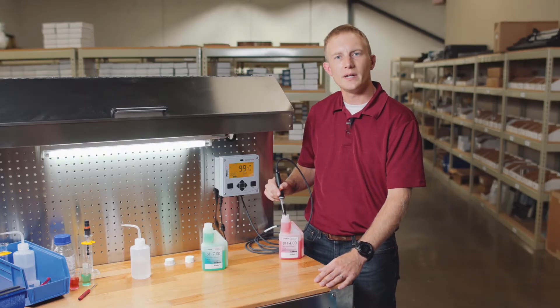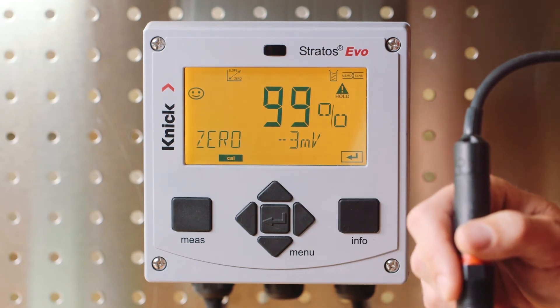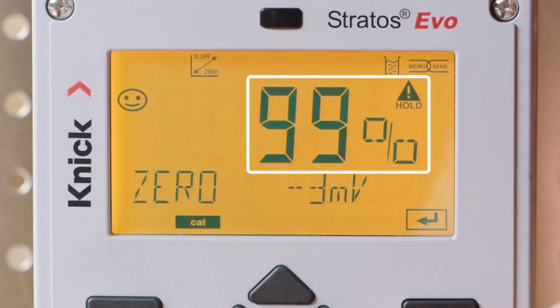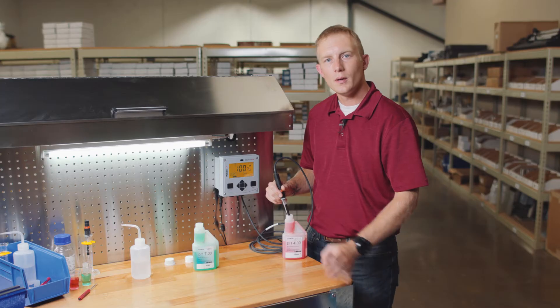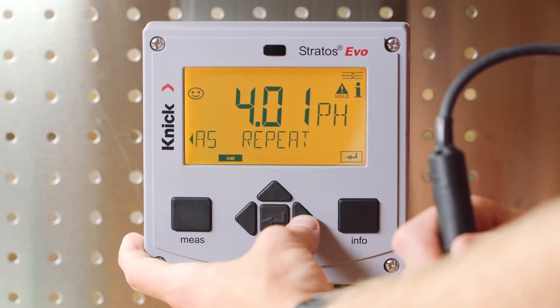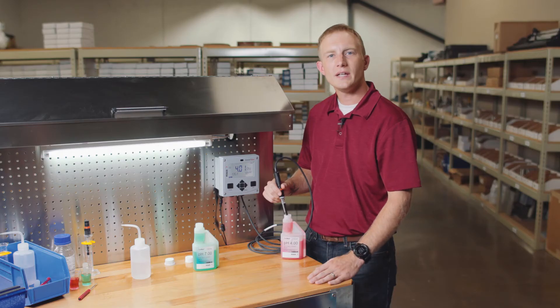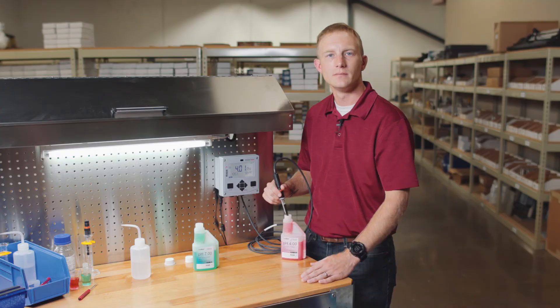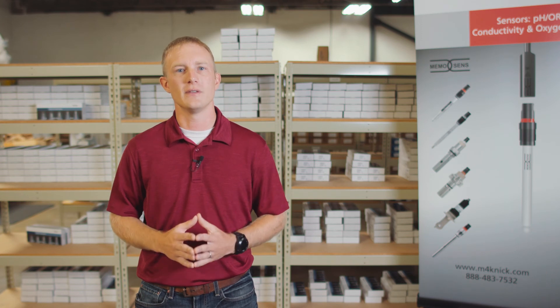Once the process is completed in our second buffer solution, you'll see that the Stratasevo then provides the specific information of our calibration. First, we have our slope displayed in percentage, next our zero point displayed in millivolts, and finally a smiley face indicating a successful calibration. Press enter and the Stratasevo will now give us the opportunity to repeat our calibration process or write the calibration to our sensor by selecting measure. Pressing enter on measure also finalizes the calibration process and returns us to the main measurement screen. We're now ready to go online with our measurement or store our calibrated sensor on the shelf for future use in the field.